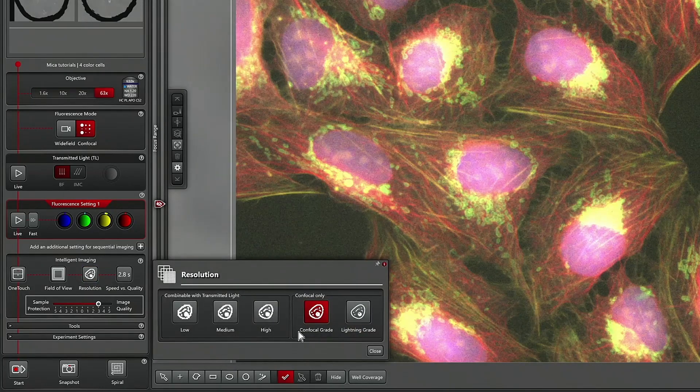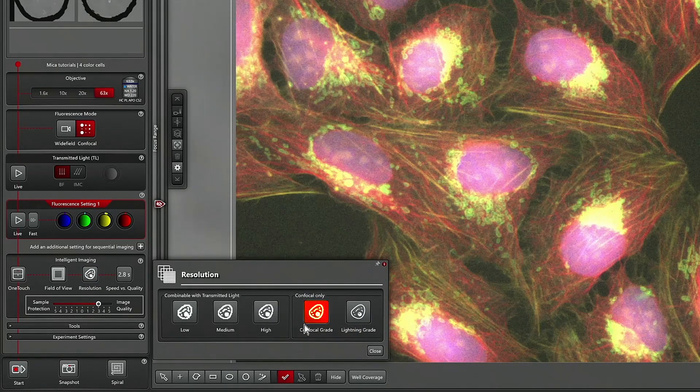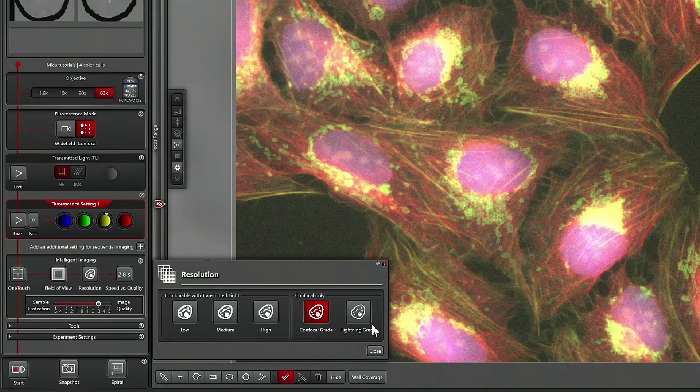You have two additional resolutions available: Confocal grade and for enhanced resolution, lightning grade.